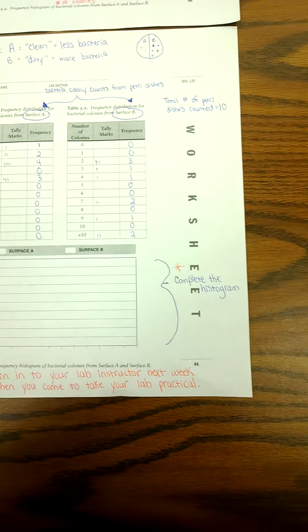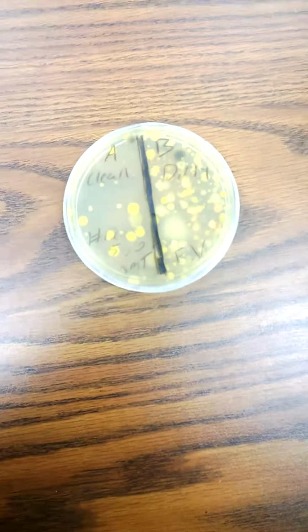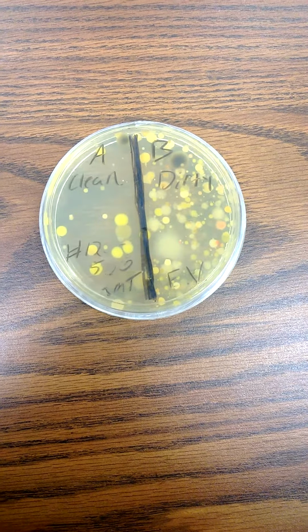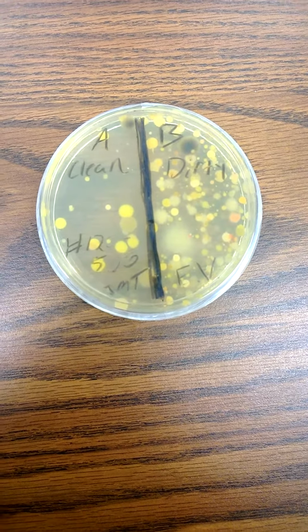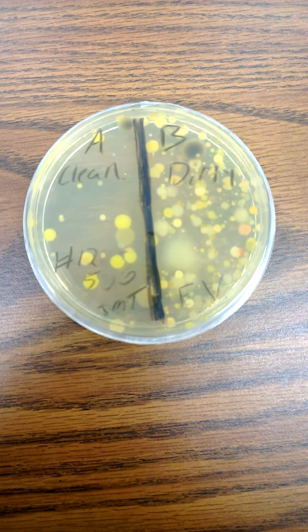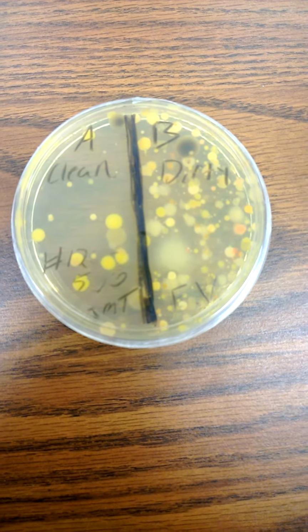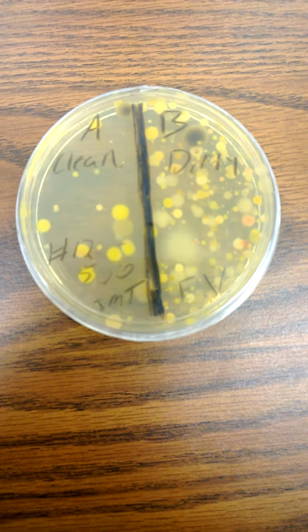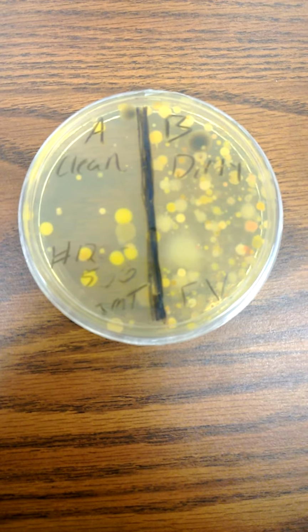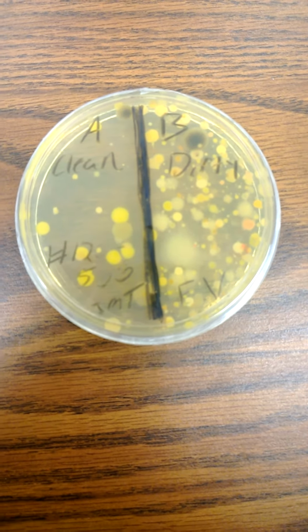Last week, as a class, you chose two different surfaces that you wanted to collect bacteria off of. You chose surface A and surface B. You chose surface A as being a surface that you thought was clean, or a surface that had less bacteria is a better way to put it.